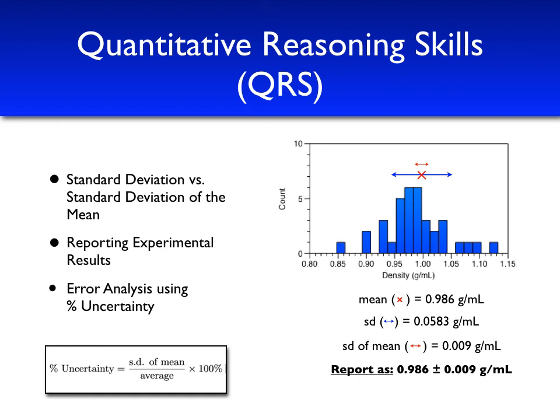So how will we use the percent uncertainty to propagate our error? Usually we would have to take a sum of the squares. There are different equations to do that, but we're going to make things simple, and you're going to, at the end, compare the percent uncertainty from part 1 to the percent uncertainty for your titration data in part 2. Whatever percent uncertainty is the largest will be your percent uncertainty for your mass percent of copper in copper glycinate.